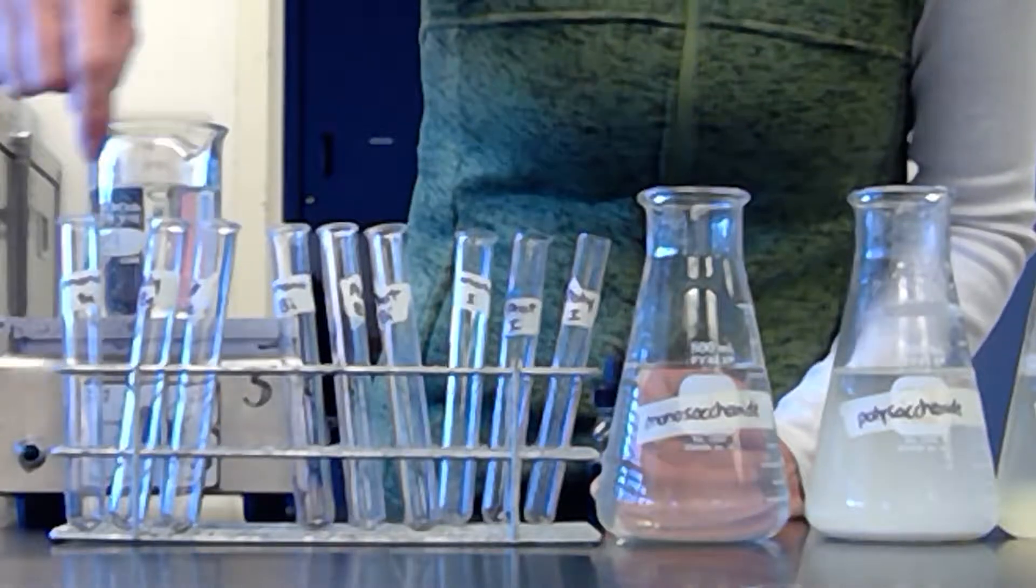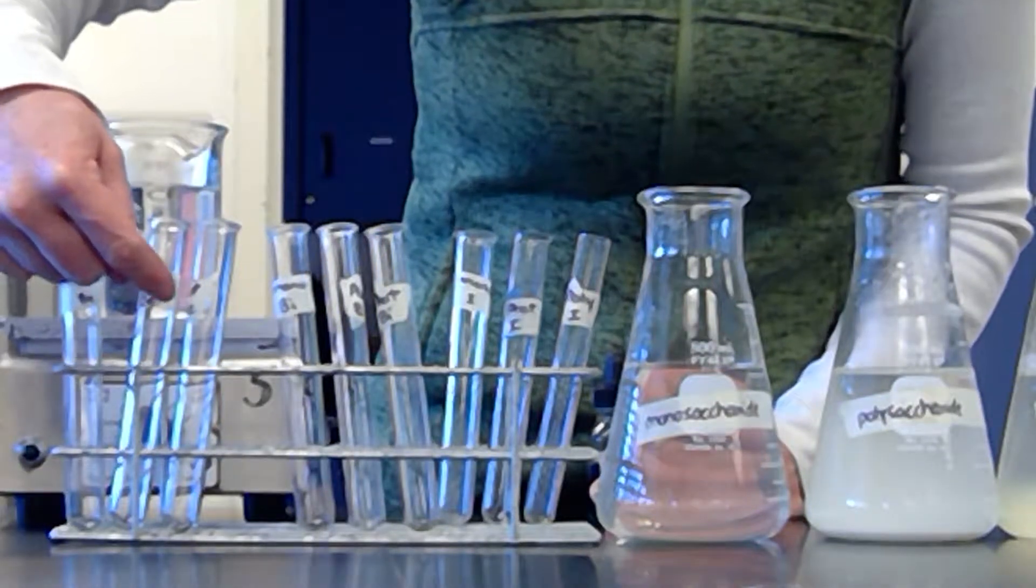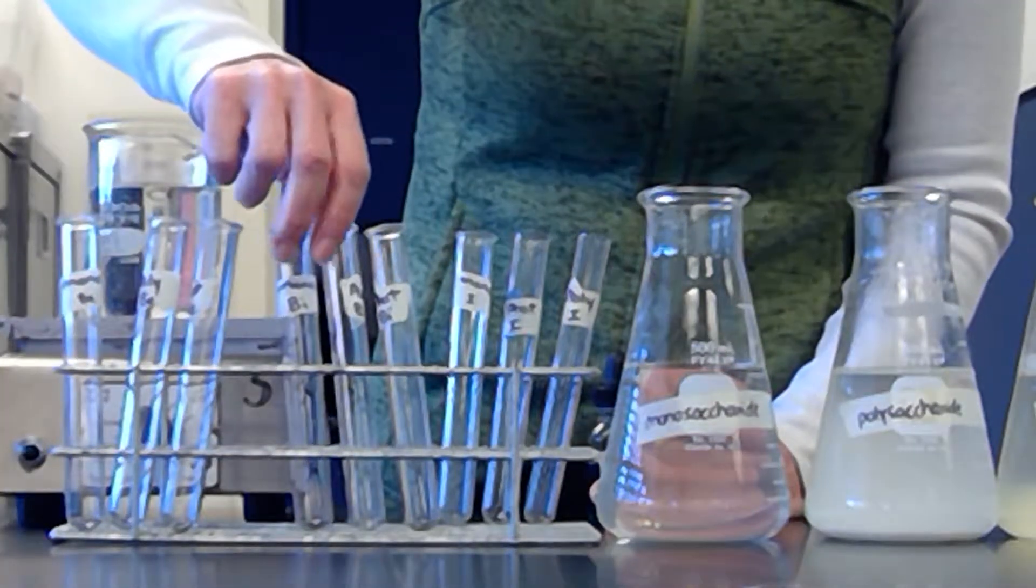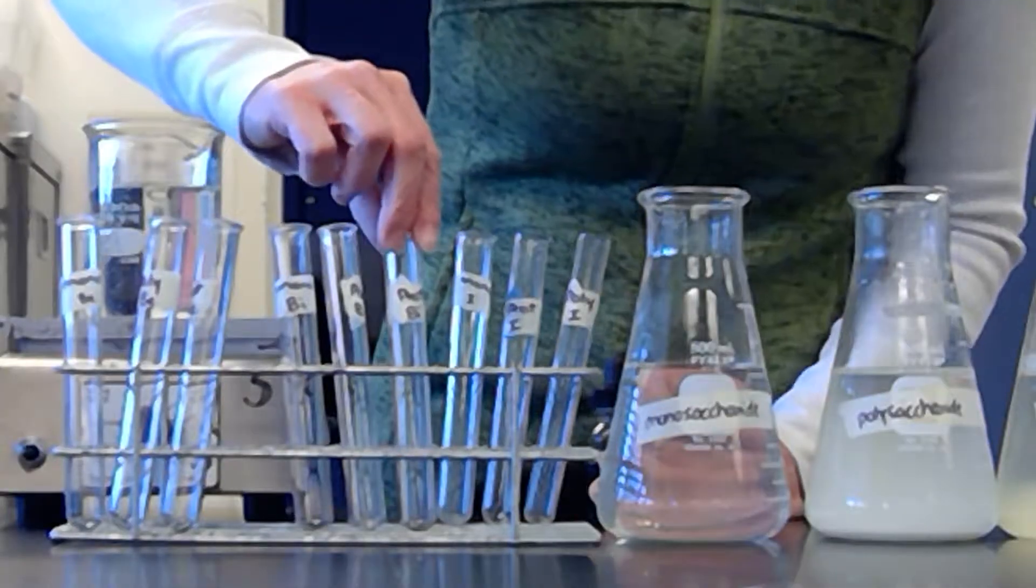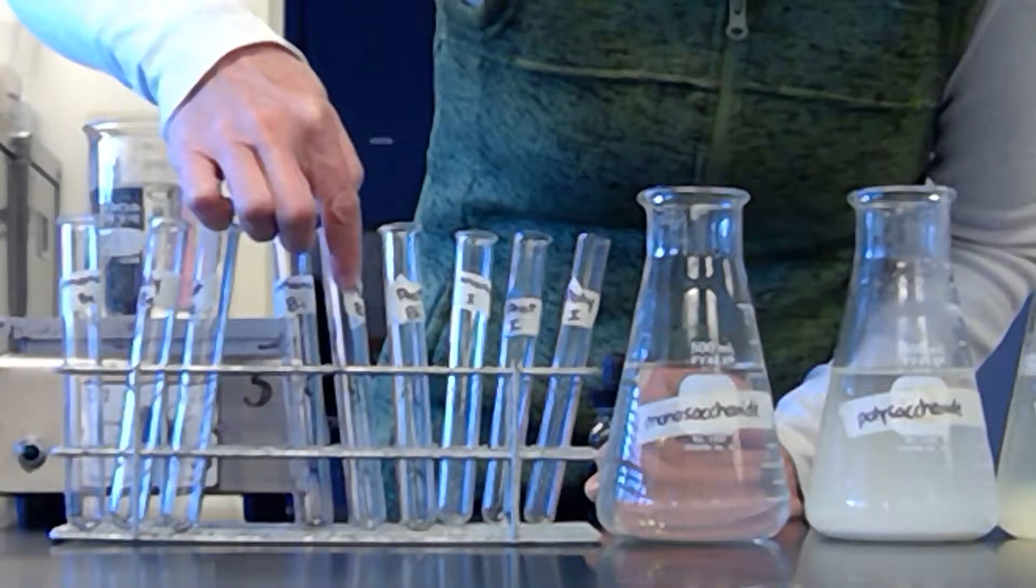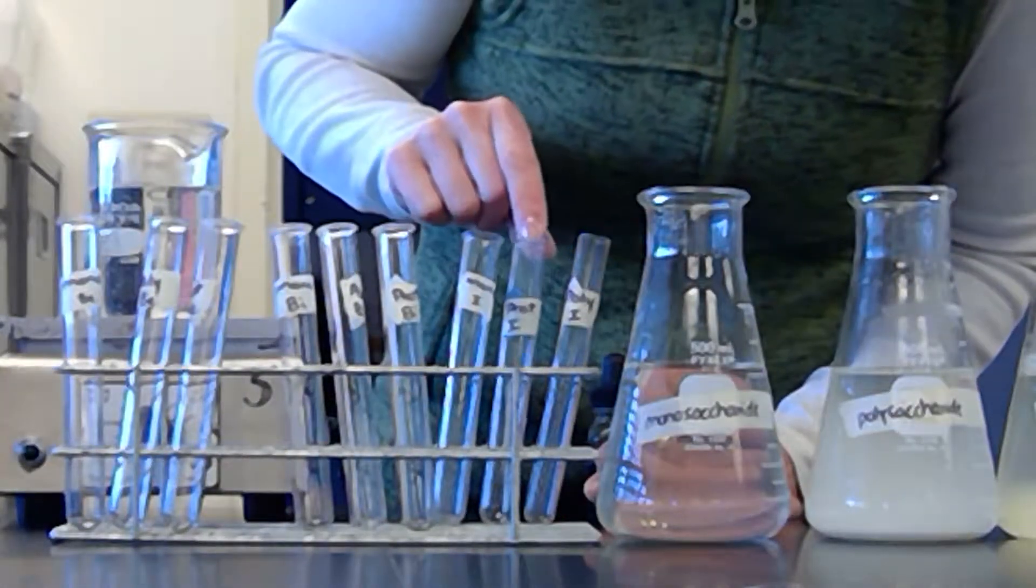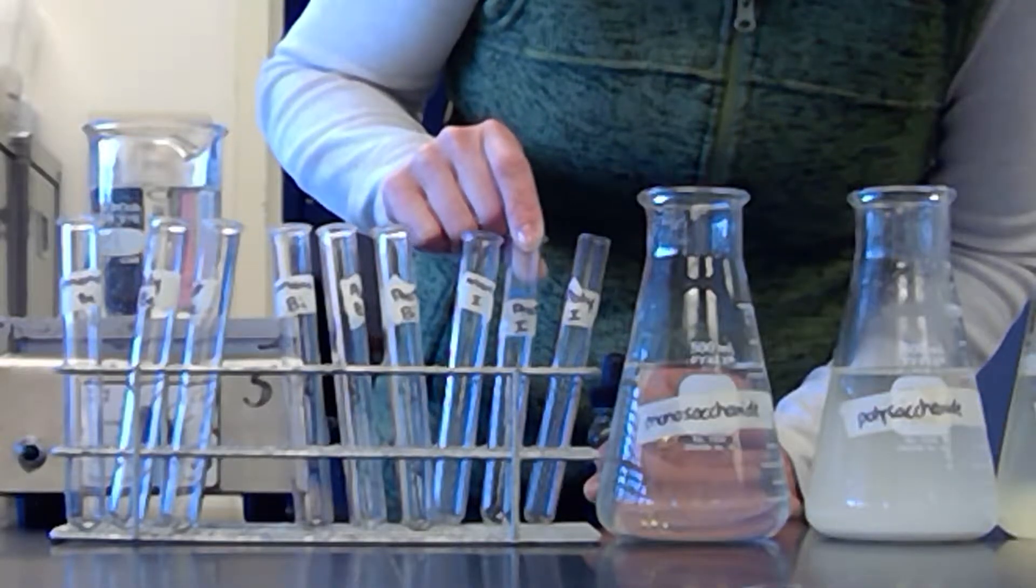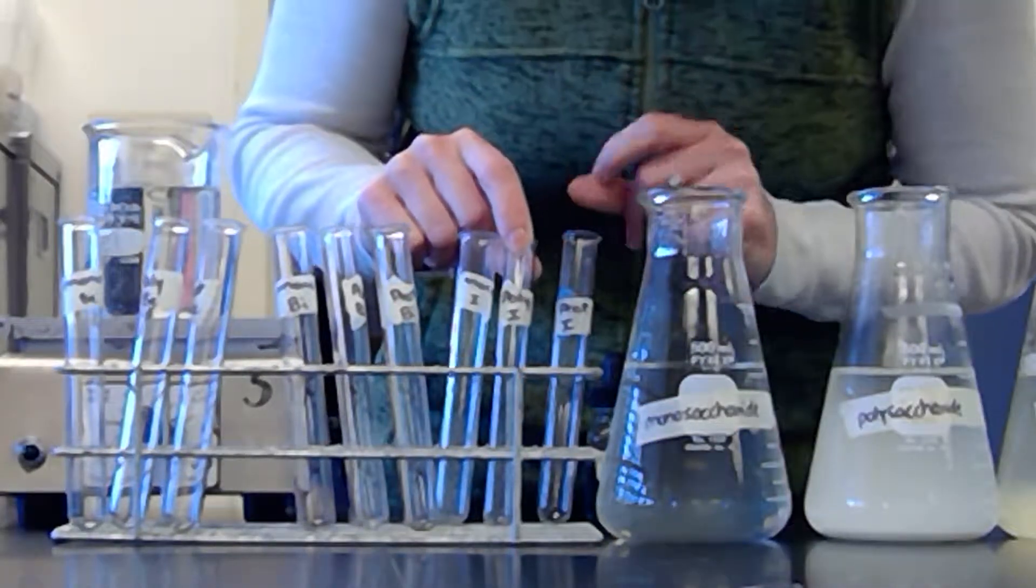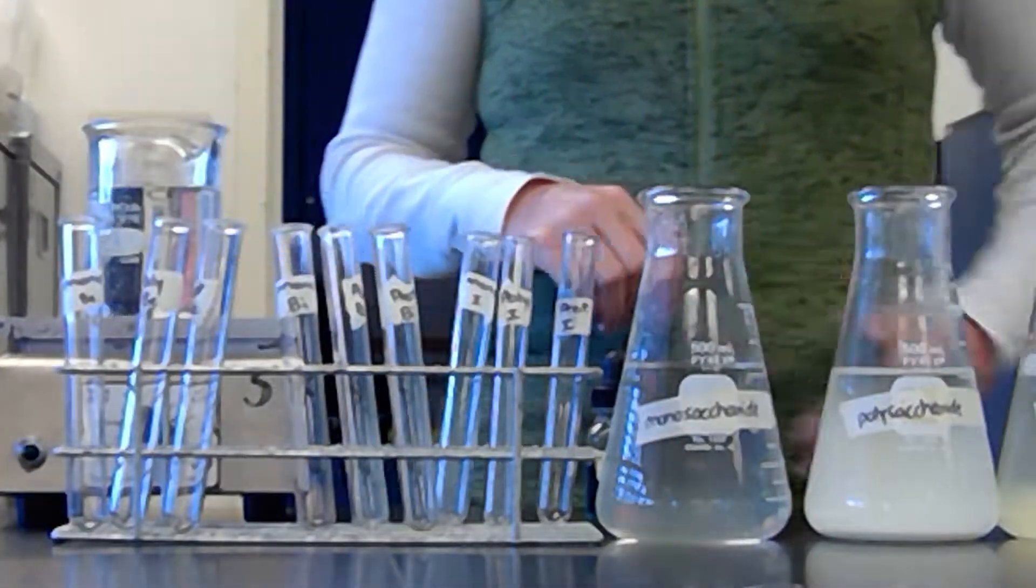So I have three different sets. This is mono, poly, protein, and then it says B, B, B for Benedict's. And then I have mono, poly, protein for biuret, and then I have mono, poly, and then proteins for iodine.